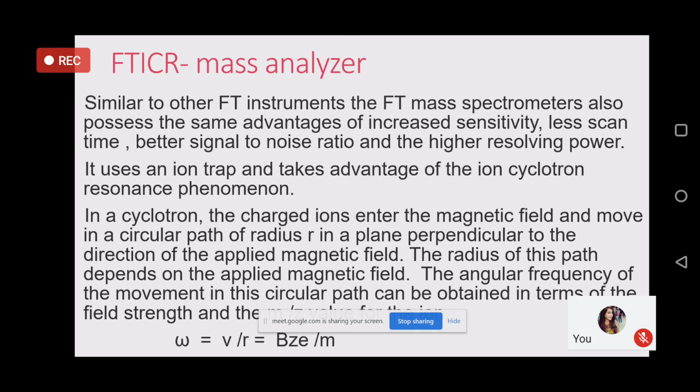In a cyclotron, you have a magnetic field applied in the form of a semicircular half disc, which you call a D. The charged particle is accelerated between the two such semicircular Ds. They are half circular Ds, and there is a gap between the two, and that gap is covered with an electric field. So the Ds are connected to the two terminals of an electric field, and there is a magnetic field applied over both the Ds. So the ion gets accelerated because of the electric field.